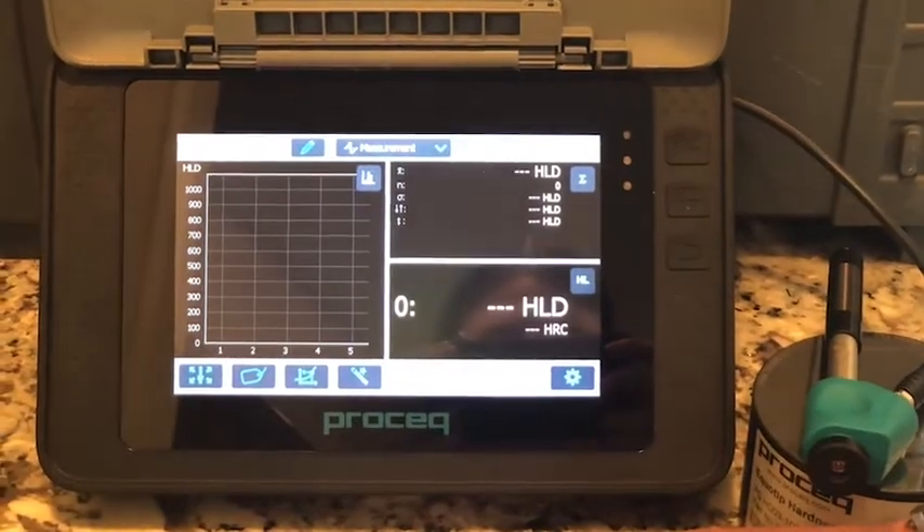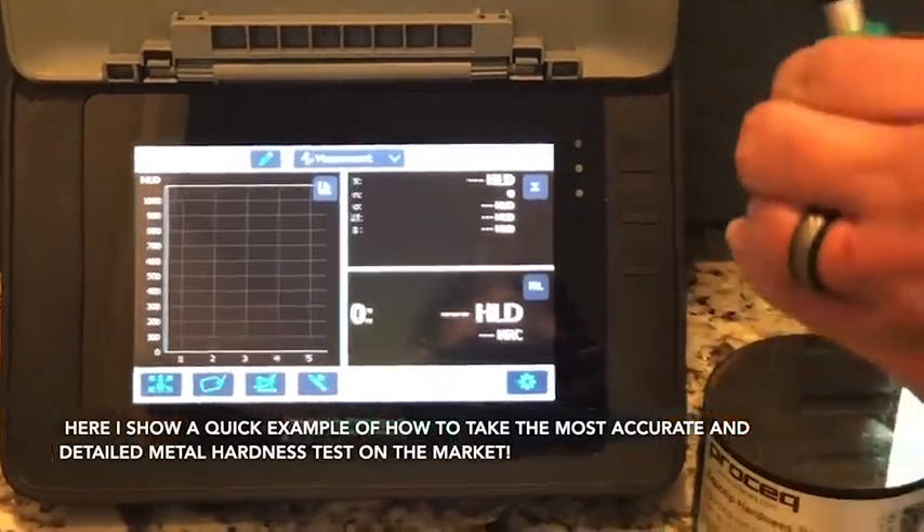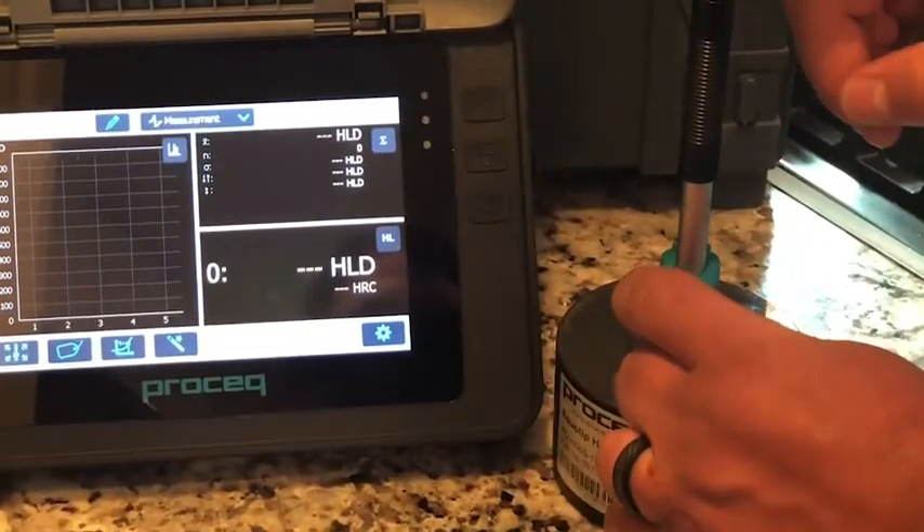Now after those very simple and user-friendly steps, you are fully prepared to take the most accurate and detailed metal hardness tests in the market. Enjoy!